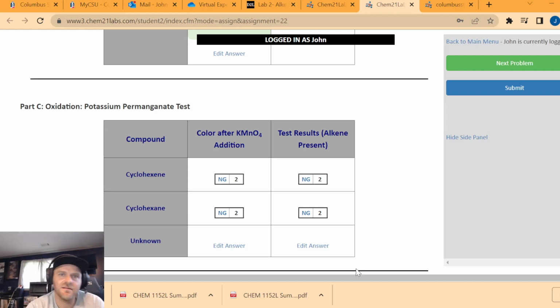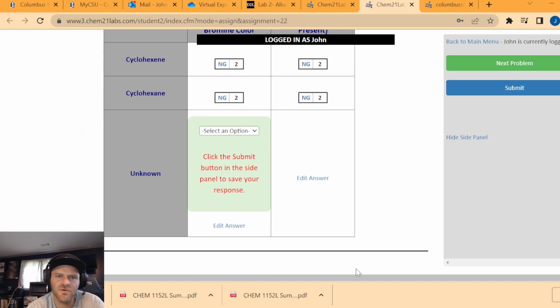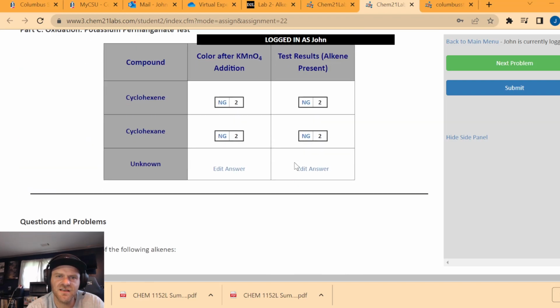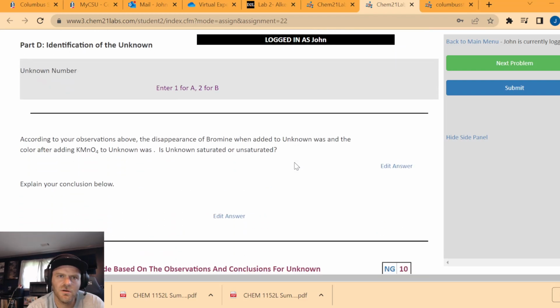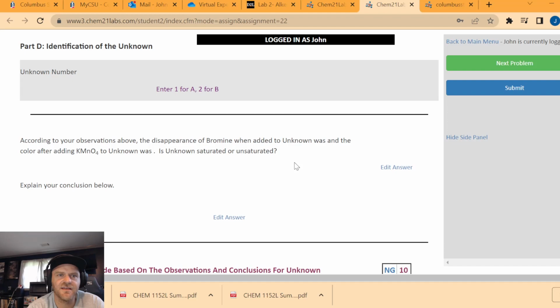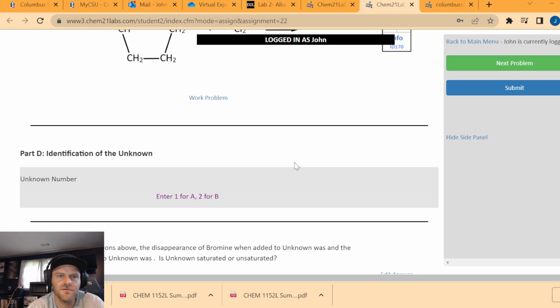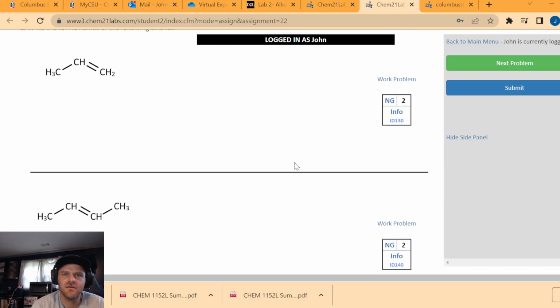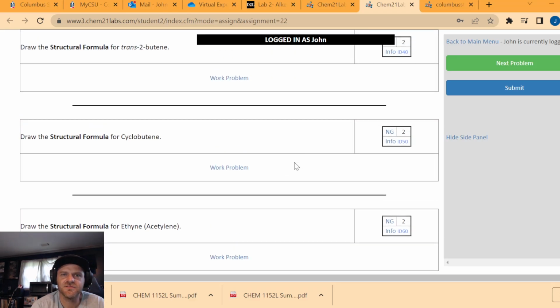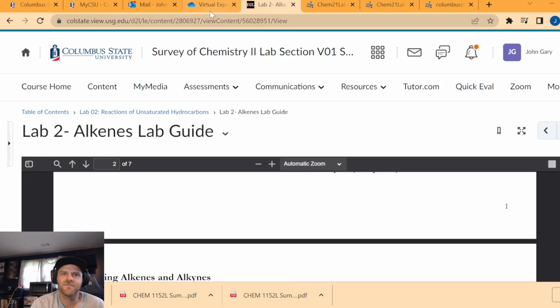And I didn't see a spot for you to list the identity of your unknown. So let's everybody do... Oh, okay. It does have an identification. So let's everybody just do one. Okay, so unknown A. Everybody do unknown A. I think that'll keep it simple. I'll make another little note of that under this video on Cougar View. All right, let me go back to the video.